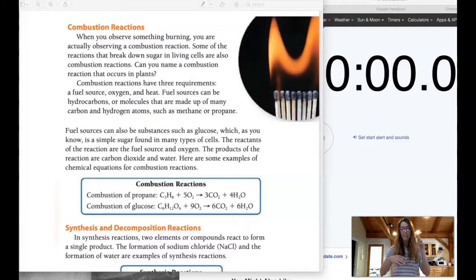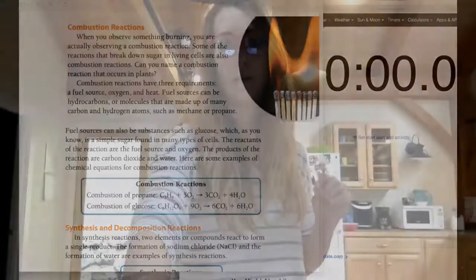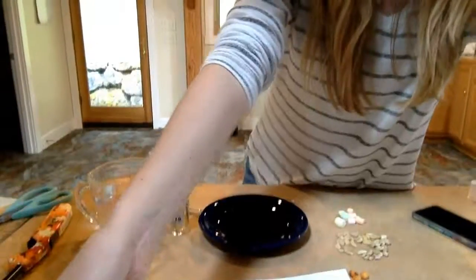Carbon dioxide and water. Okay, so I am going to flip my camera around. At least I think I am. Okay, so you're going to need a few things for this lab. And let me bring this down.